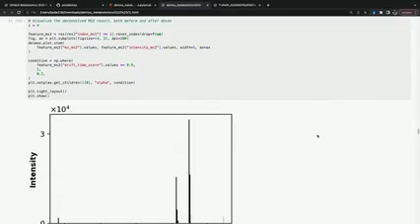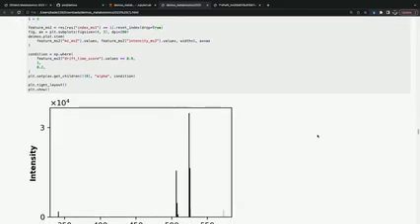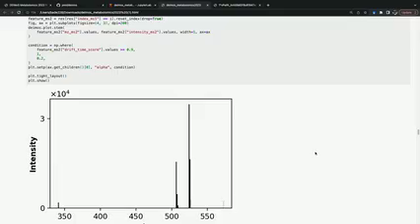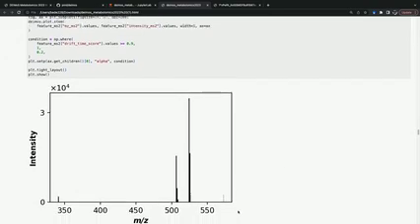Here we're just showing an example deconvolved result for one of the precursors. The associated fragments are shown here in this MS2 spectrum, and we've color encoded these peaks by the drift time score. We've applied a threshold of 0.9 to those scores, where 1.0 is perfect association, so 0.9 is a fairly high drift time score, and we can use that to filter out some fragments that may not be as associated with the precursor, and those are shown in gray on this plot.